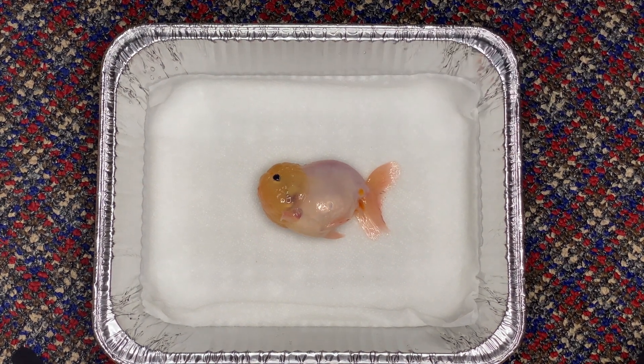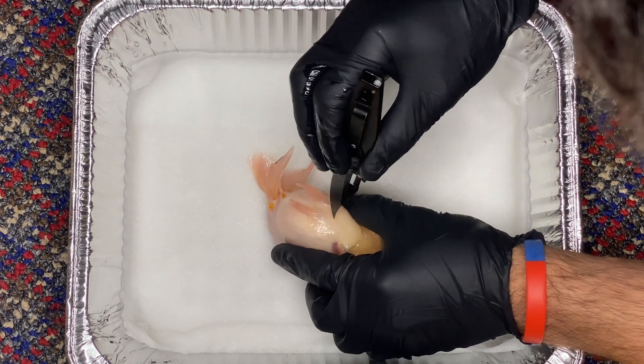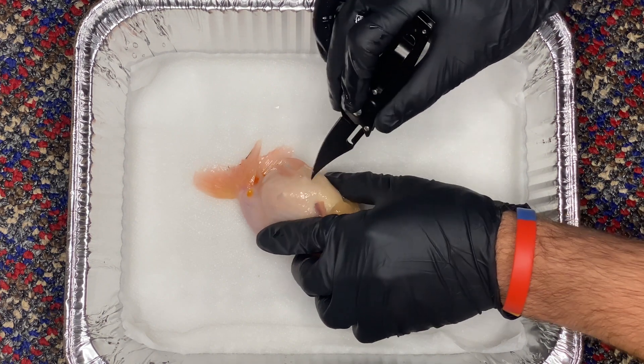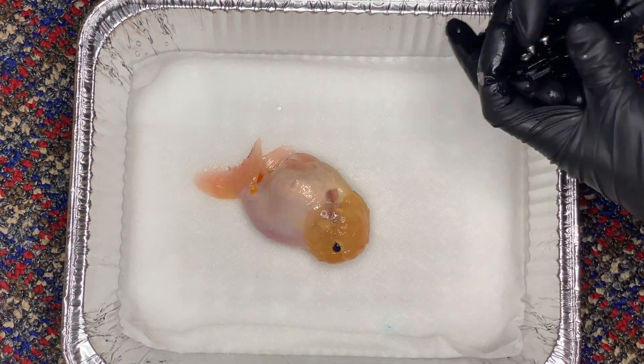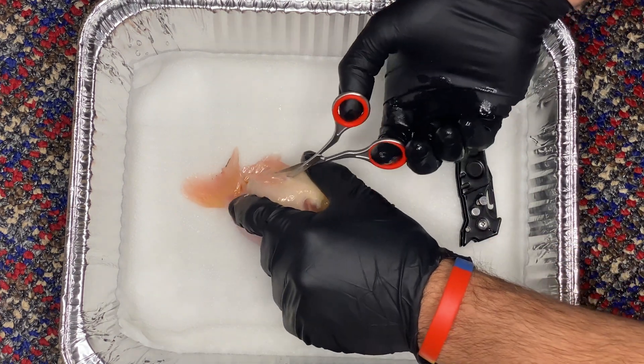I want to show where the organ placement is. If you ever have to do a swim bladder procedure and you want to know where the swim bladder is and the organs around it, this will just kind of help you out. And if you're just wondering where the organs are in the fish and what they look like, this will help. So the first thing I had to do was basically just make a little puncture underneath the side of the body, just to make a hole for me to use scissors to cut the rest of the way through.